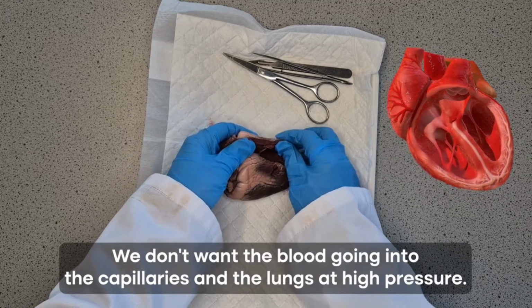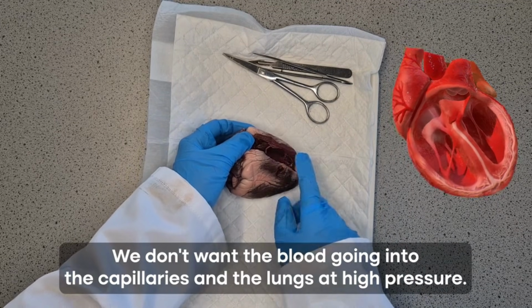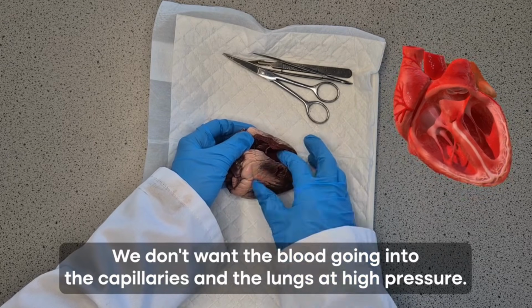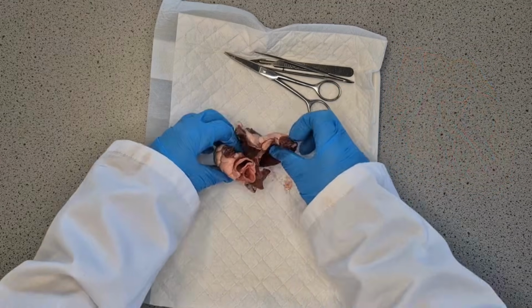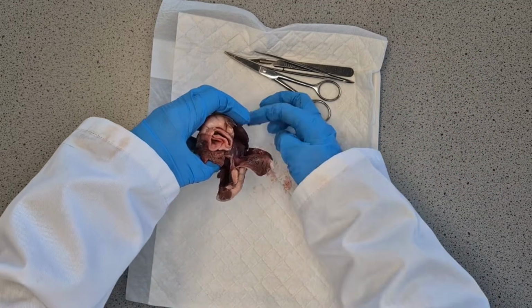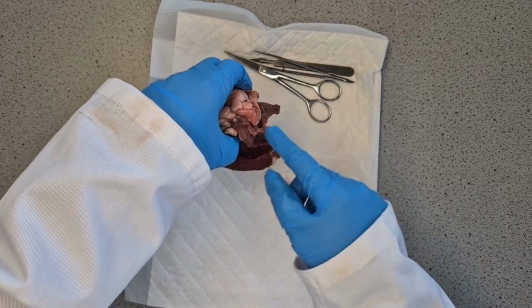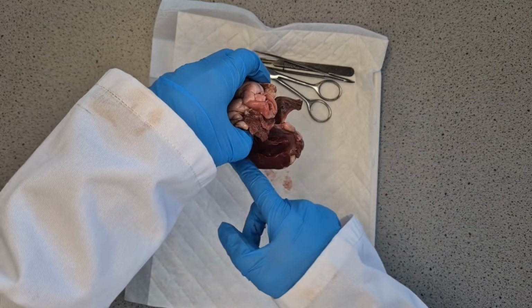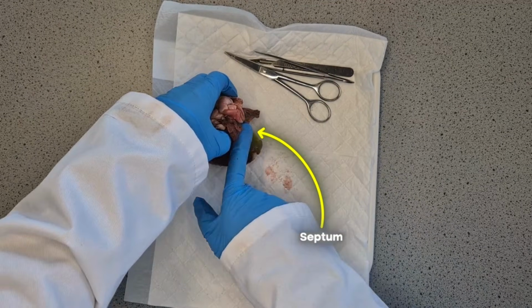And also, we don't want the blood going into the capillaries in the lungs at high pressure, because that high pressure could actually damage the capillaries, and we want it low pressure, so it flows through slower, so there's more time for gas exchange. So now I've actually cut down both ventricles. We can see this section in the middle of the heart, that is dividing the right and the left side of the heart, and that is known as the septum. So that is what is separating the two sides.